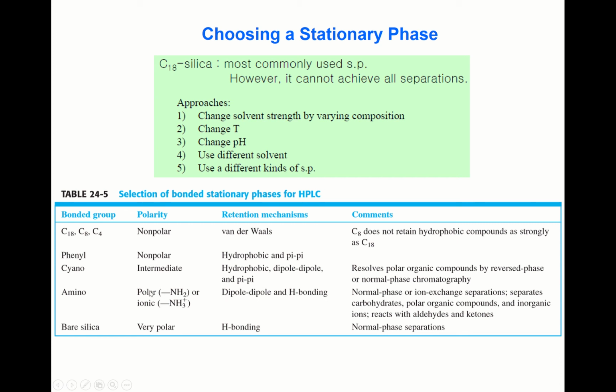And you may choose phenyl bonded phase. This is also good for non-polar compounds, because the phenyl group is also non-polar, but not as non-polar as the octadecyl, though still non-polar. So the retention mechanism is also hydrophobic interaction, and here pi-pi interaction. Why?